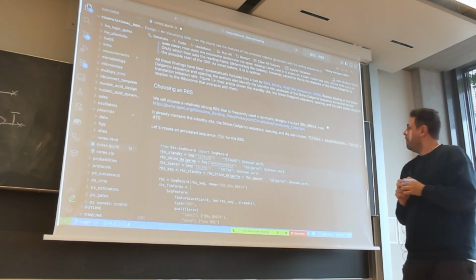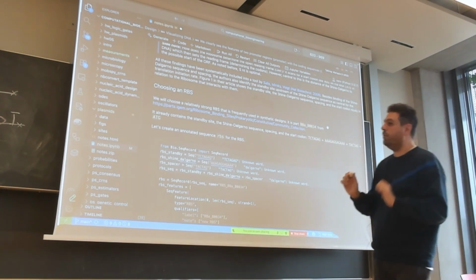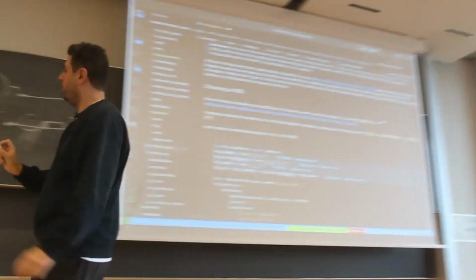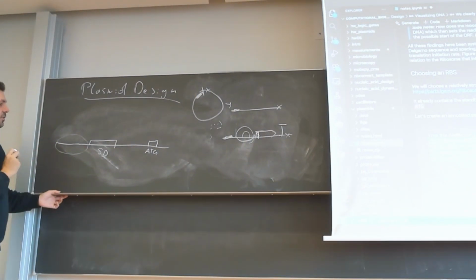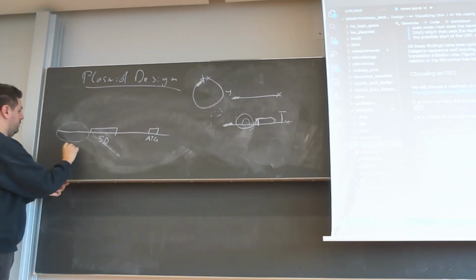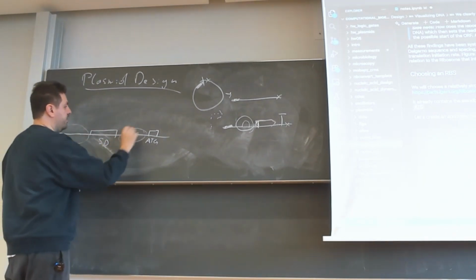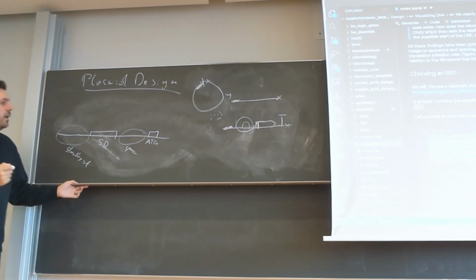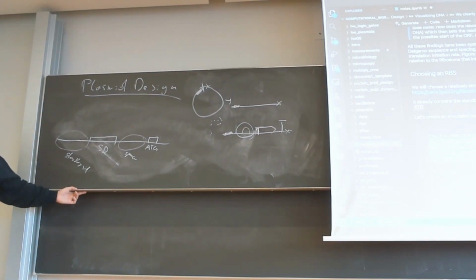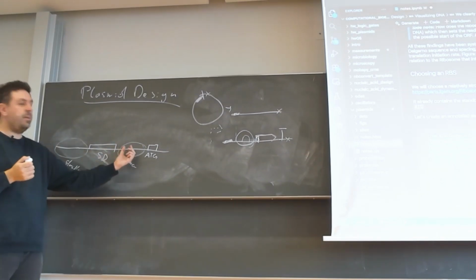Then we have to add something on the left side: what is called a standby site. And on the right, we have to add something called a spacer. Again, there have been many experiments by really good researchers about what the right spacer is.